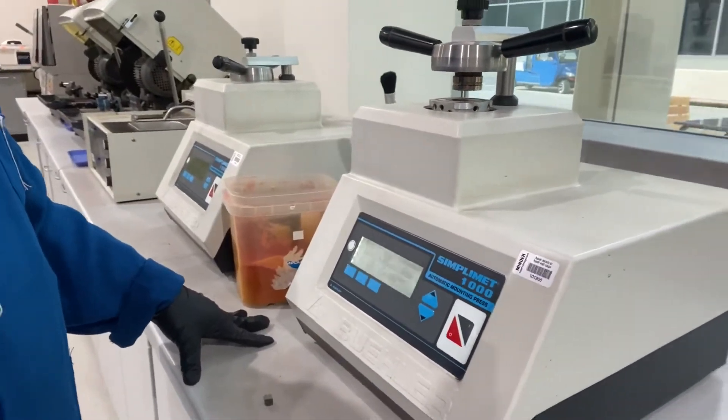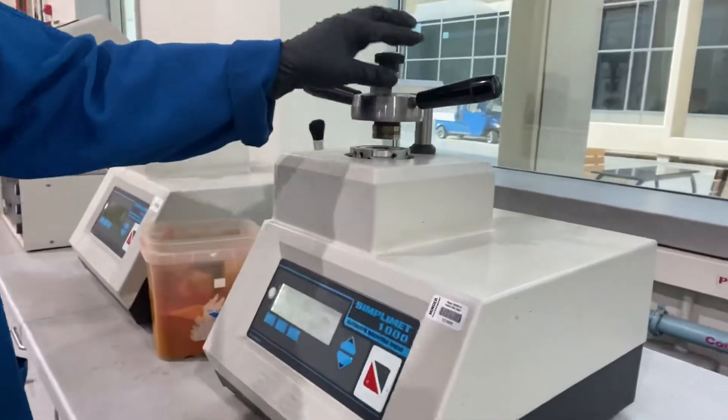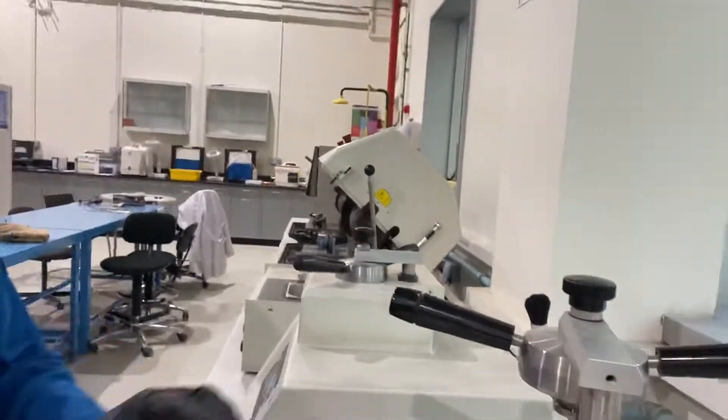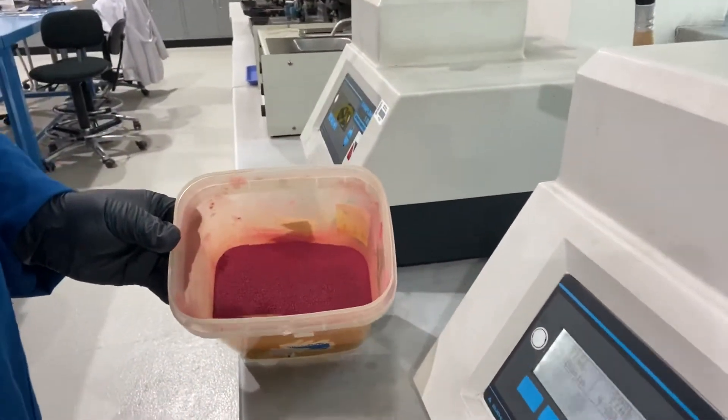Second step is mounting. You need a mounting press, a mold the size of 40 millimeter, and a thermosetting phenolic powder.